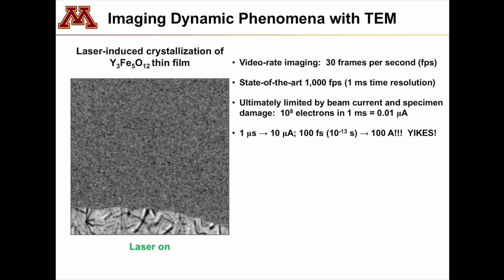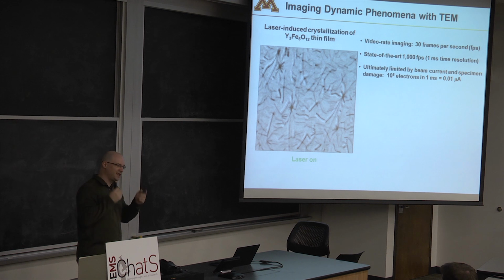So a millisecond, just to calibrate you again: if you're really good at blinking, you can blink your eye about 10 times in a second if you're flying, right? It's probably more like 5 times in a second. You can try it. Yeah, people are trying it, good. So think about that. What that means is it takes me about 0.2 seconds to blink. Here we're talking about 0.001 seconds, right? So that's just to give you a sense of what we're talking about. That is top of the line. You're going to shell out a lot of money, and that's the camera you got.